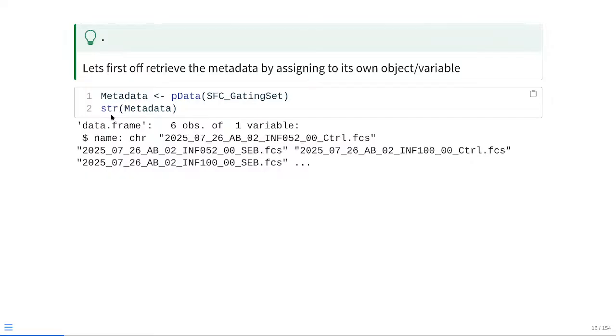When we check the str function to see what's happening behind the curtains, we can see metadata is basically another data frame that we've encountered throughout the course, more recently within the tidyverse week 4 class. This is one we can use the dplyr package on to clean up that particular file name, make additional columns, and do a lot of the data manipulation and data tidying process we've seen for the last couple of weeks.